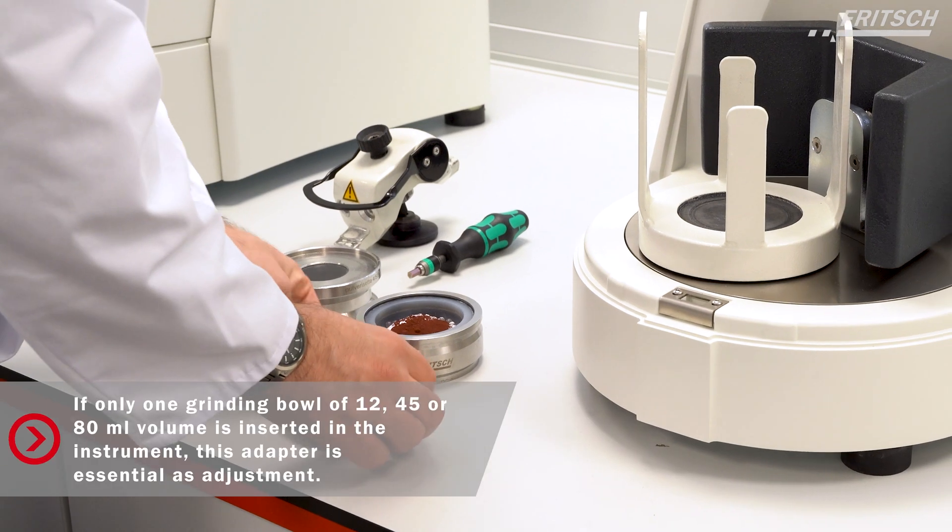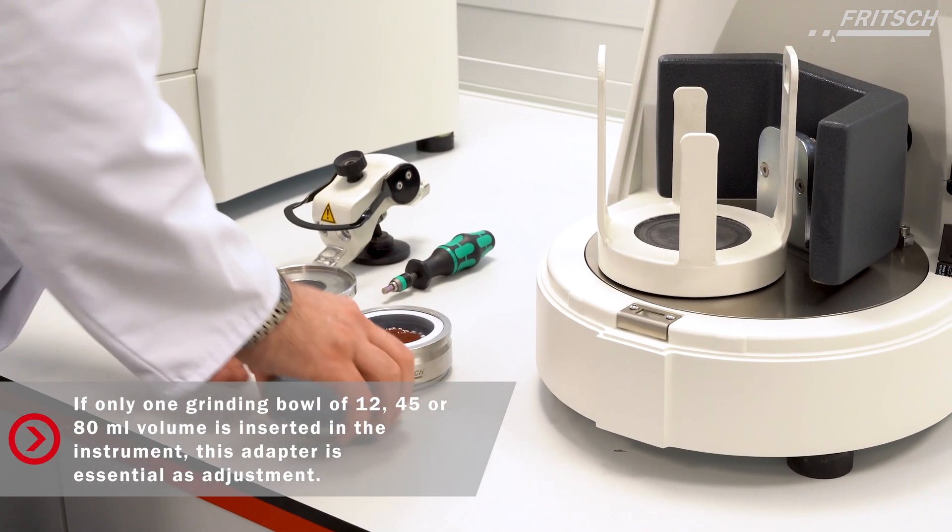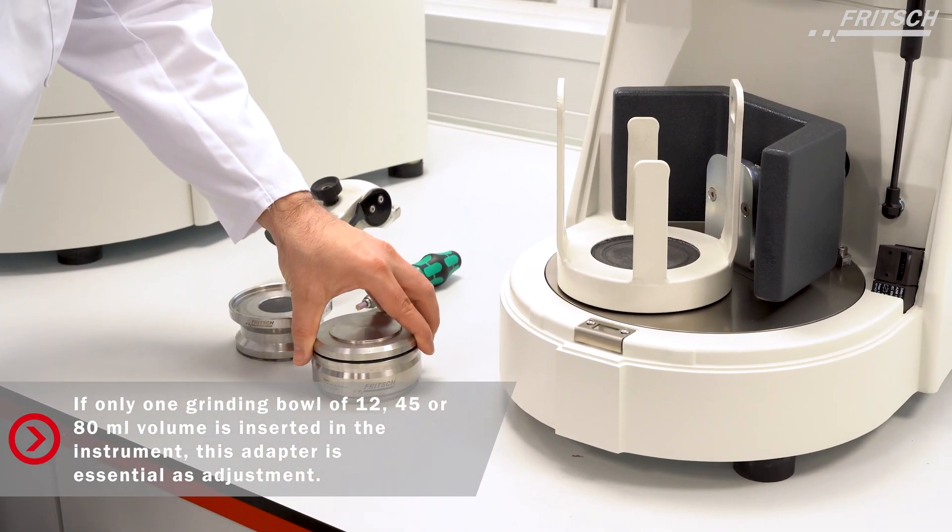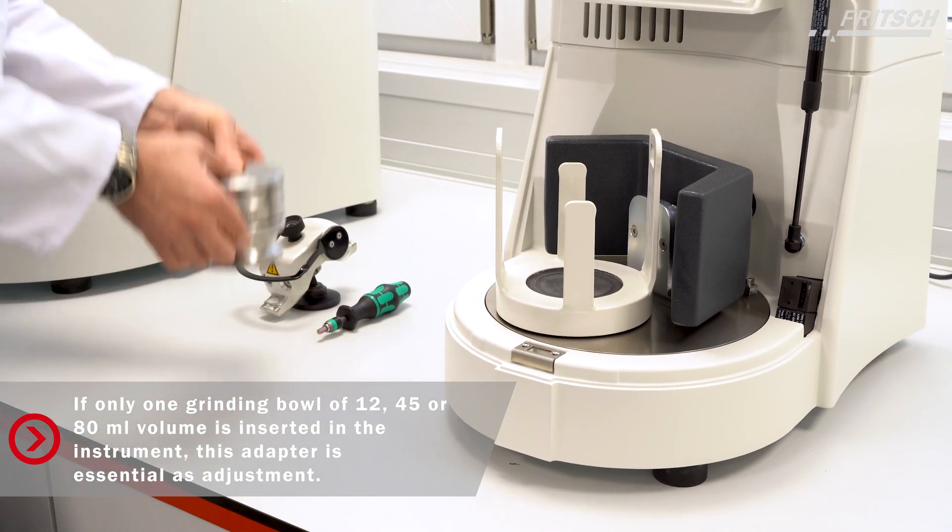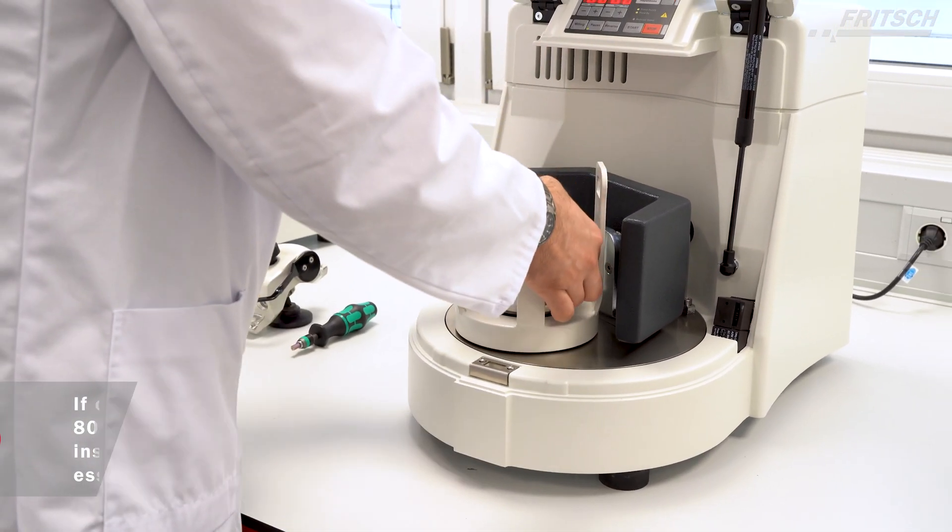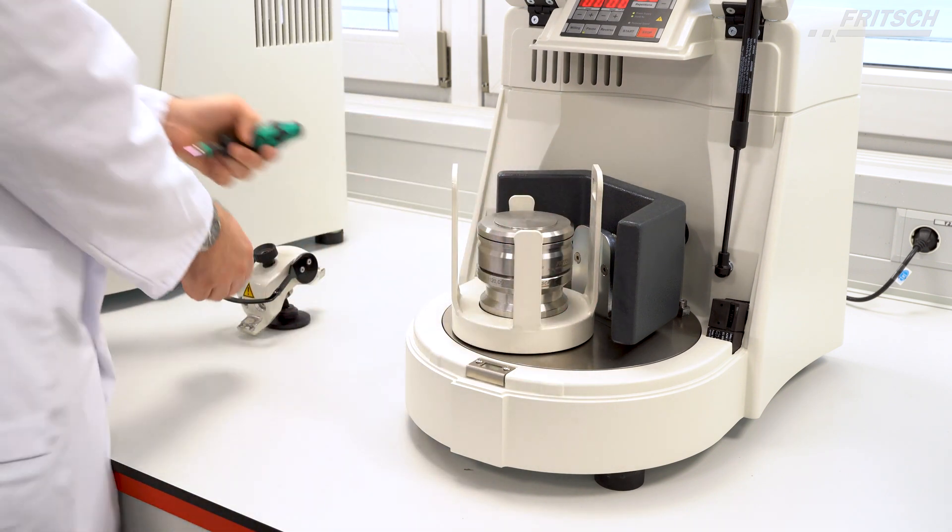If only one grinding bowl of 12, 45, or 80 ml volume is inserted in the Pulverisette 6 classic line or the Pulverisette 5 classic line, this adapter is essential as adjustment.